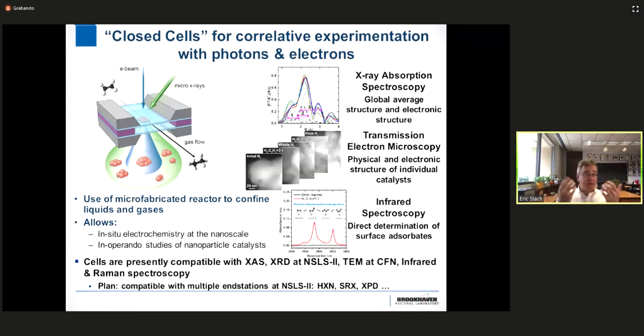And then you can take that same sample and bring it over to that operando instrument I just showed you and do all the things that TEM can do. So you're able to do nanometer to atomic scale resolution and correlate the information you obtain from all of these different techniques. I think this is really an amazing capability that's really unique to Brookhaven. It maybe wasn't as unique as it was 2 years ago because people have been stealing the idea abroad, but in America, really, this is the place that you could do this sort of work.